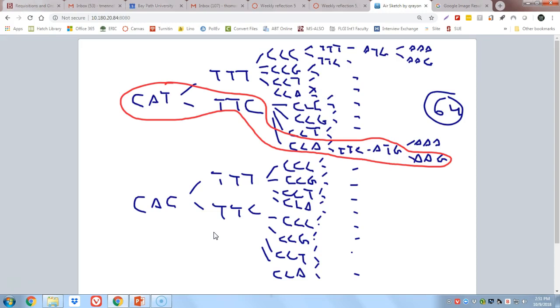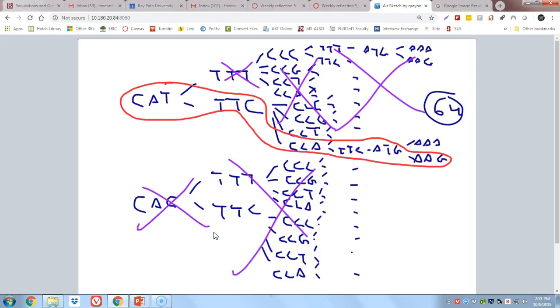That means none of the other primers were correct. And they're all in our reaction, taking up space and taking up room. But we had no idea of that going in. We created a pool of 64 heterogeneous primers, all of which encoded histidine, phenylalanine, proline, phenylalanine, methionine, lysine. All of them encoded those 6 amino acids, but only one of them was the exact right complement of our target gene of interest. That one primer, the one that is the right complement, is the one that binds, it's the one that primes, and it's the one that can amplify our gene of interest.